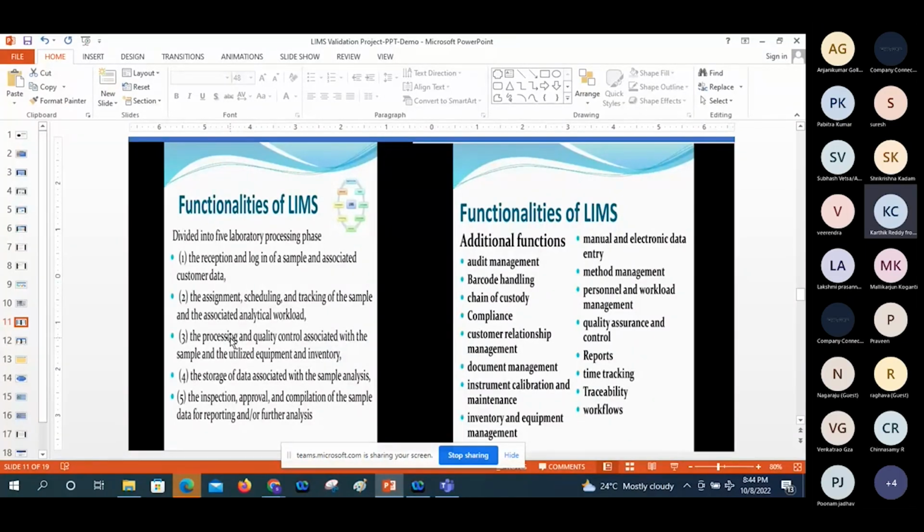There is scheduling of samples from environment monitoring as well as instrument samples, logged through the schedulers. So there is an instrument scheduler, a stability scheduler, and an environment monitoring scheduler. Different types of schedulers can be available, as well as the SAP LIMS scheduler.